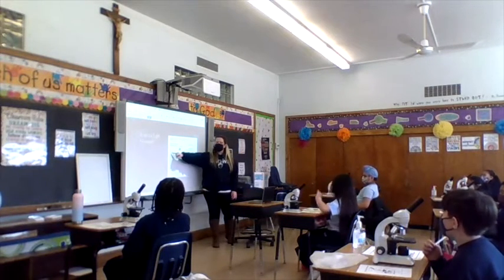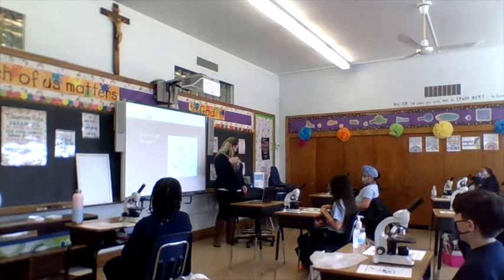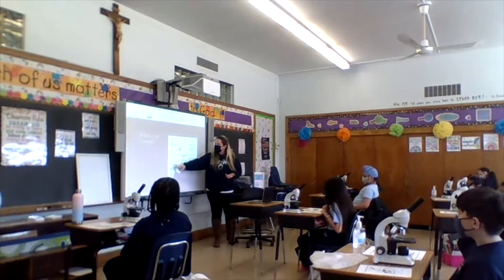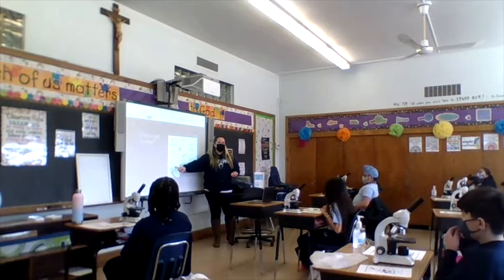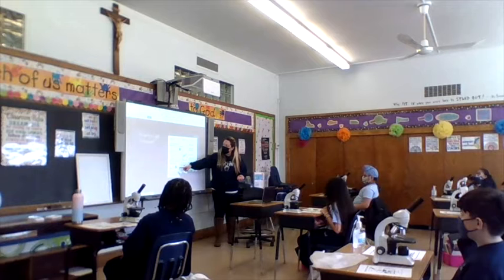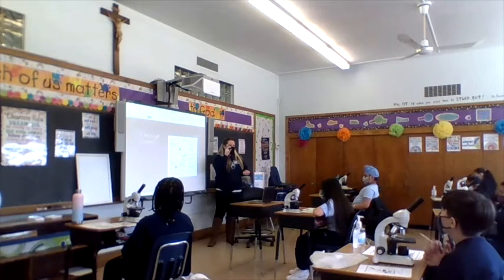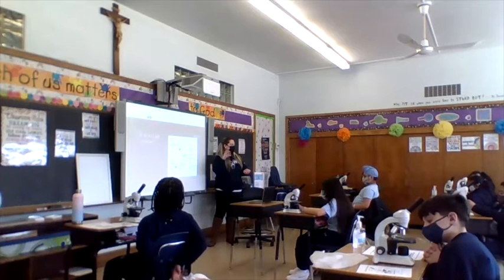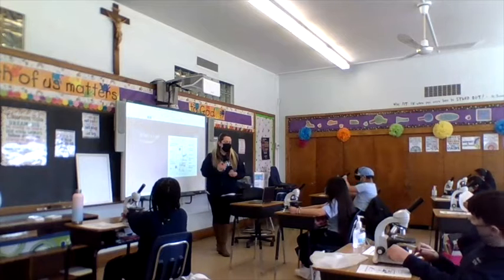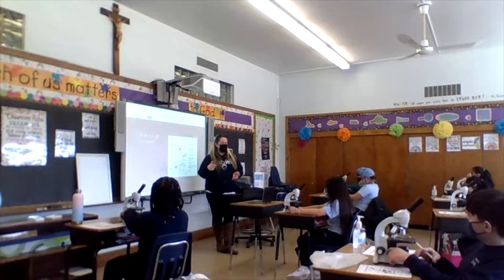This one? Everyone? Arm. The arm is where you hold it when you carefully carry it to put it back or to take it out. Fine focusing mechanism. Say fine focusing mechanism. Good. The fine focusing mechanism on your microscope is the smaller one. That's why it's called the fine. Can you touch the fine focusing? And my friends at home, if you're on your virtual microscope, you can start clicking it to look at the different parts.